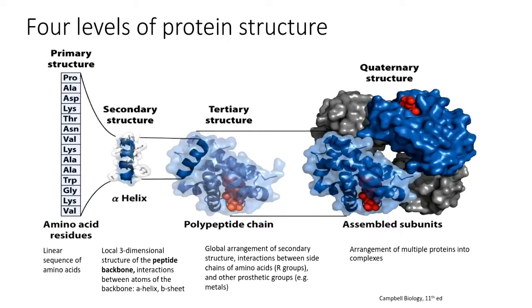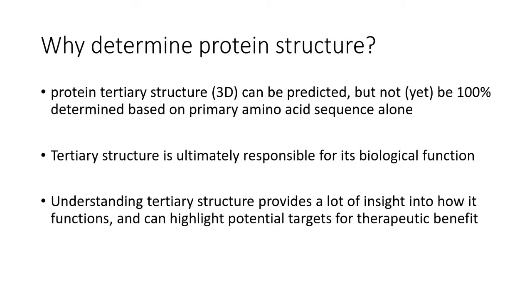So the protein we're going to work with today is going to be one domain of a more complicated spike protein. I did design this exercise in such a way so you don't have to download the quaternary structure, because it's really hard to switch between all of these subunits trying to find which one to work with. So we're going to download the amino acid sequence only for the one subunit of a pretty complicated protein of coronavirus. So who cares about the 3D structure?